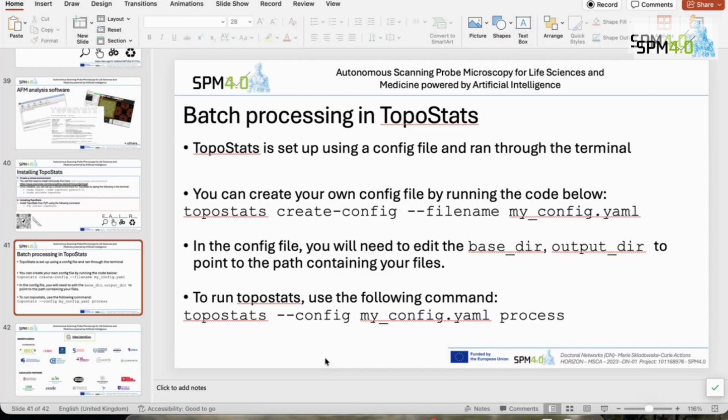I've done. So we'll see. Oh, I need to have one. Yeah, you got one. So I just check. No, I said set the base directory to. Oh, no.